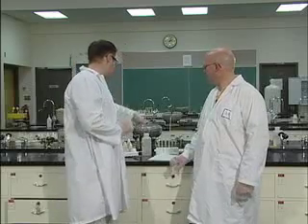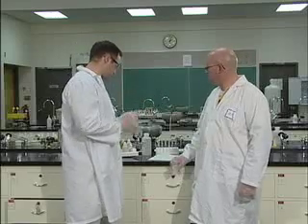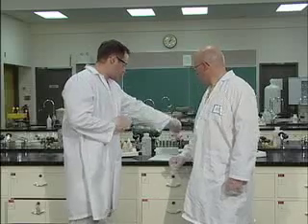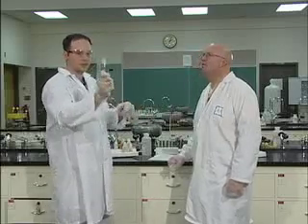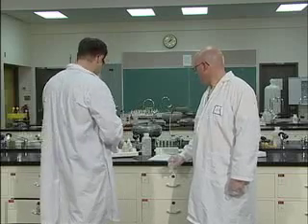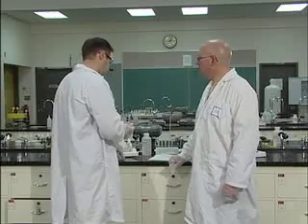Again, with the magnesium, make sure you're holding it away from your face. It gets really warm. Don't hold it by the bottom of the test tube, it will actually burn you. It's quite warm, so just be careful with it. Now, this one here, we've already pre-labeled these ones again. This is C2 as an example. Into C2 we're going to put 30 drops of aluminum nitrate.